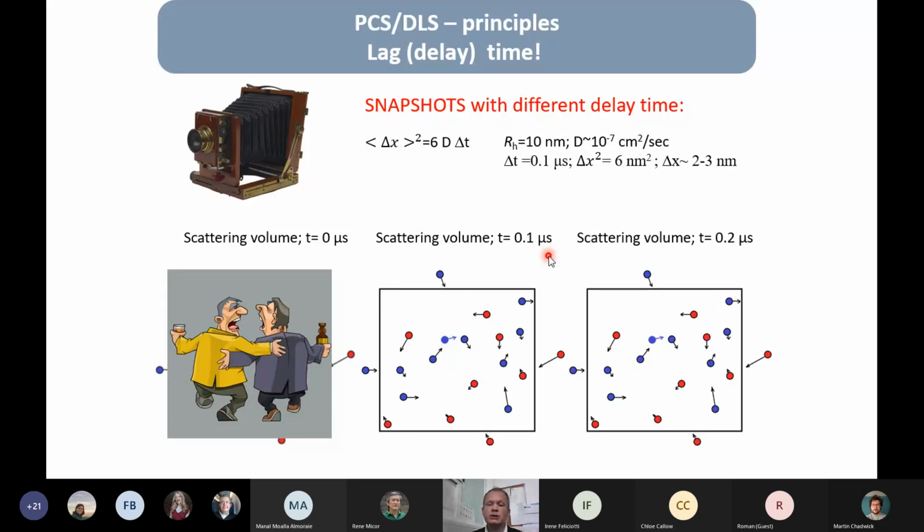that means we can actually predict how many students, or how many proteins, will be on the next snapshot, and that means that we have a very deterministic, a very predictable system. We know exactly how many proteins we will have in every 0.1 microsecond.